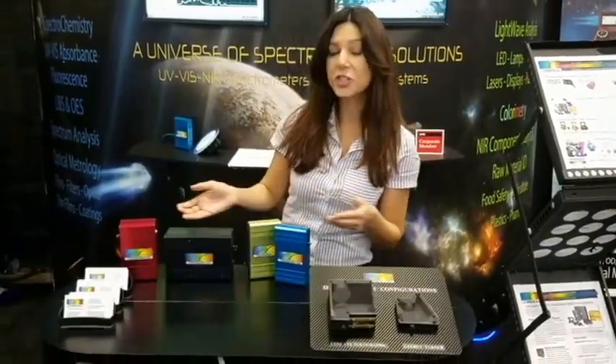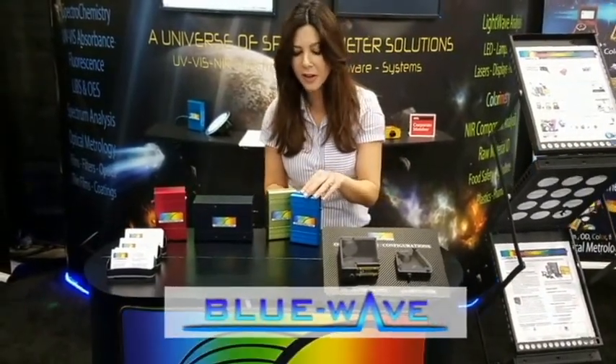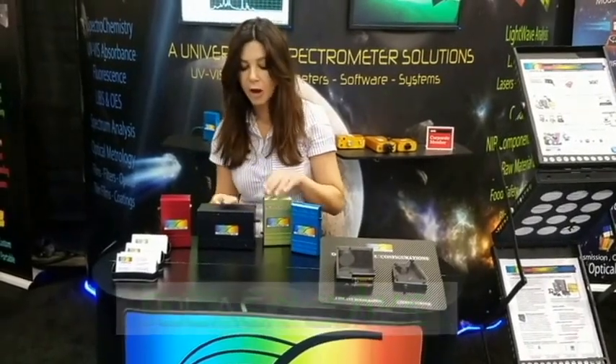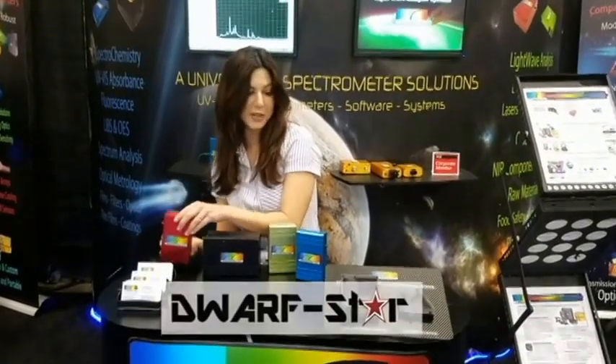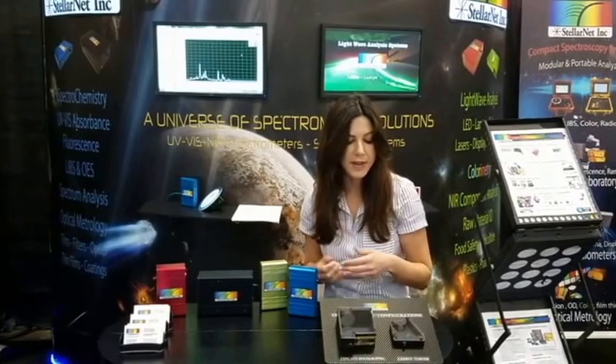Hello. StellarNet offers a low cost miniature line of spectrometers. Right over here we have our Blue Wave spectrometer, our Green Wave spectrometer, which is great for universities, our Black Comet research grade spectrometer, and our near IR spectrometer. And right over here we are showing you the inner workings of the spectrometers.